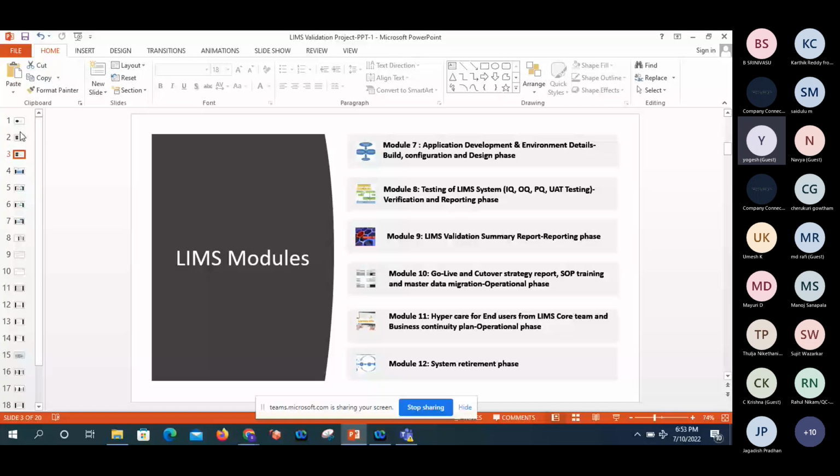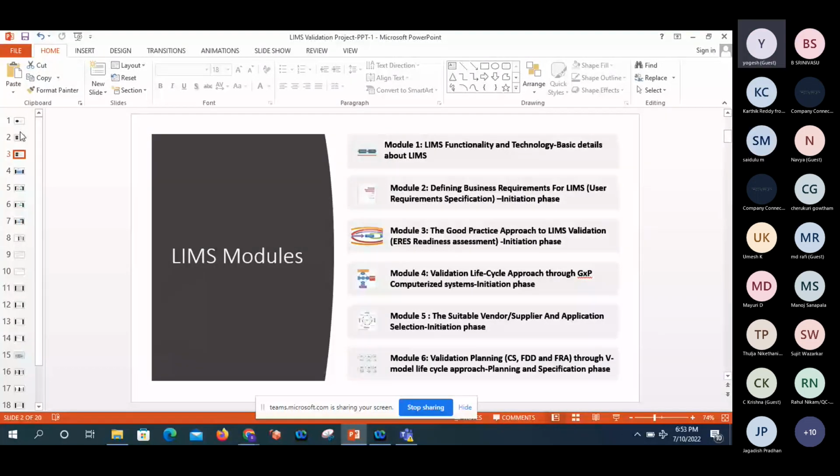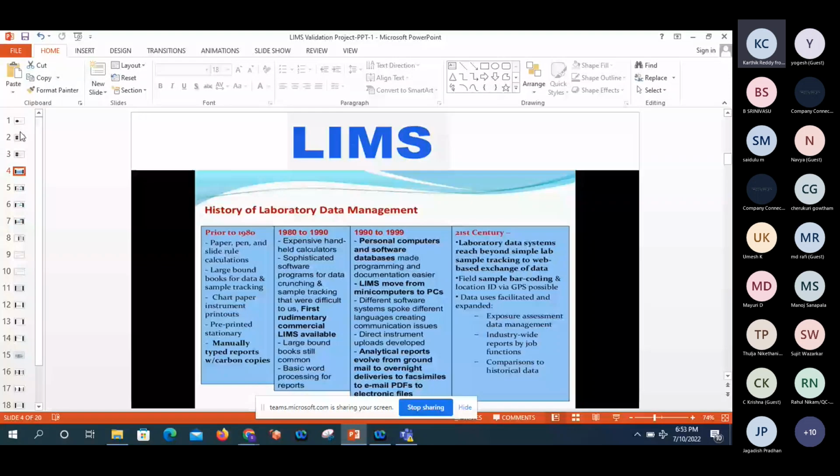Sir, in this course, can you cover the ERP LIMS interface? Yes, I will explain the general things: how the inspection plan is generated in SAP, how it is integrated with the PI process engine and then to LIMS. Once the lot is generated from SAP to LIMS, there is post utilization also, so the COA is directly triggered to SAP. I will explain the procedure available in the current industry.